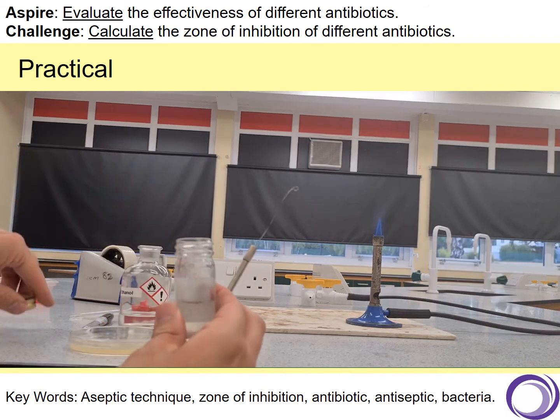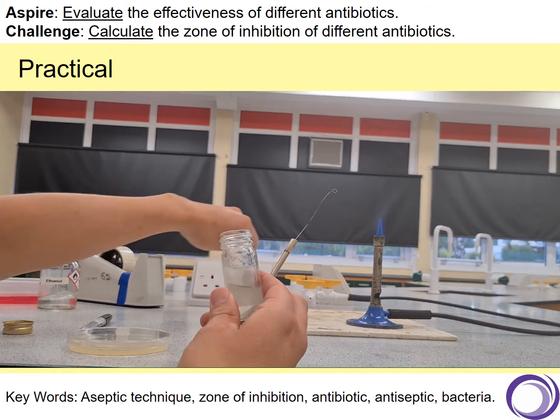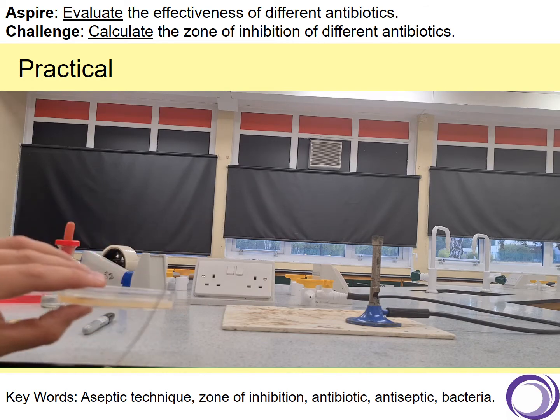Now I've finished using my ethanol. That needs to go very far away, and I need to turn my Bunsen burner off completely, so I'm not going to get any issues with that.